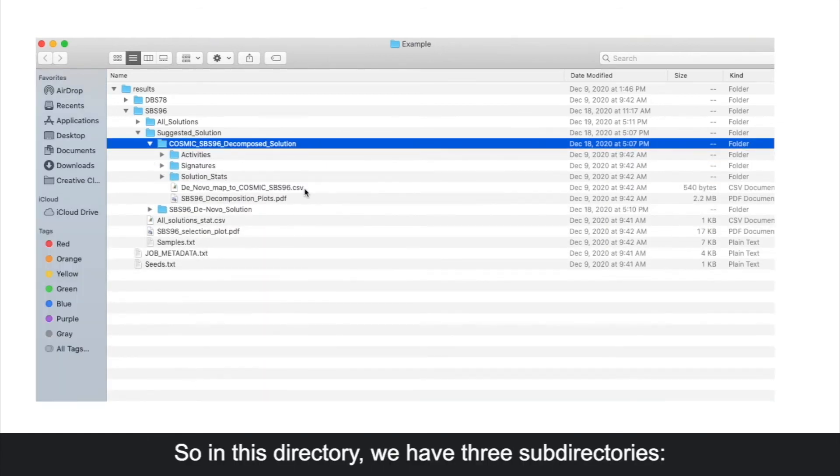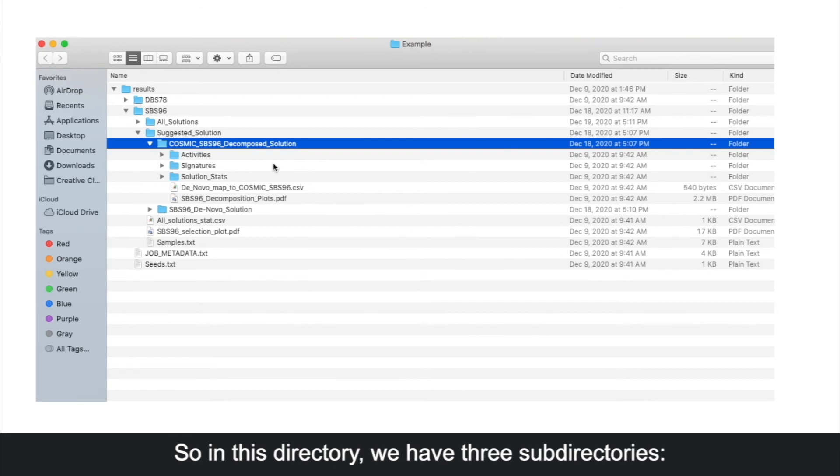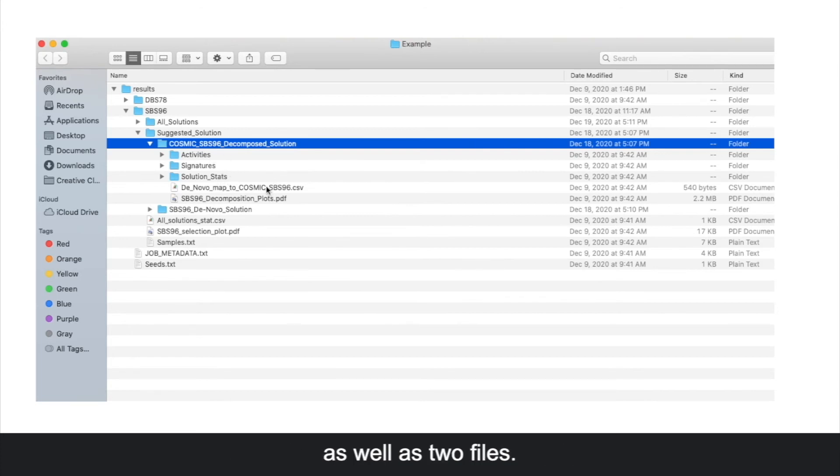In this directory, we have three subdirectories: activities, signatures, and solution stats, as well as two files.